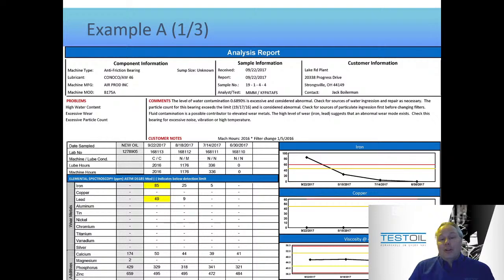And so we're looking for a number that's like 3 microns or even lower if we want to see a reduction in the iron, a reduction in the lead, a reduction in most of the particle count, and it's going to need some sort of desiccant aspect to that filter. Much like we have desiccant breathers, you can have a desiccant oil filter to actually absorb the water out of there. Otherwise, we'll have to wait for the water to evaporate slowly, which won't be as immediate of change as particle count would be. But in the end, we are deciding what to do next.